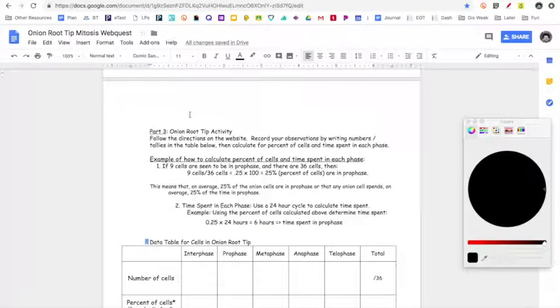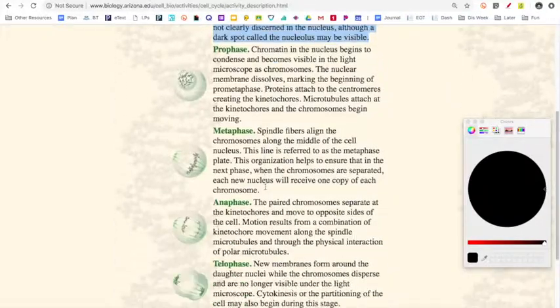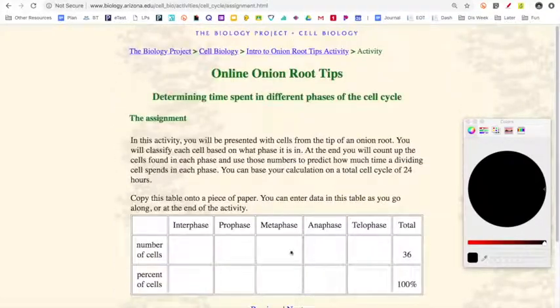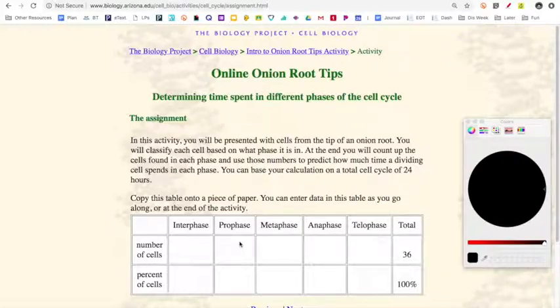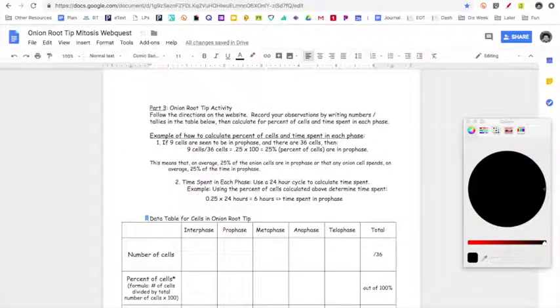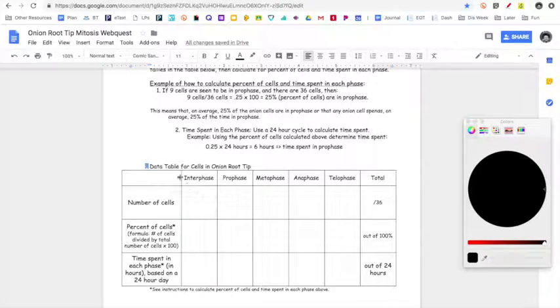In order to get to part three in the activity, you're going to have to click the next button down at the bottom. What this says is it's going to show you pictures of cells from the tip of an onion root, and you're going to classify each cell based on what phase it is — meaning you're going to put it in a bucket: interphase, prophase, metaphase, or anaphase. In order to do this, you're going to need this little table. You don't need to copy it down — I've made it for you.